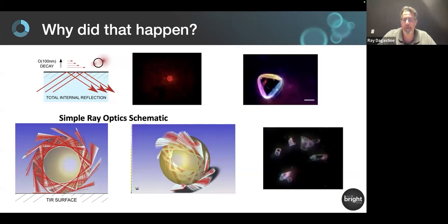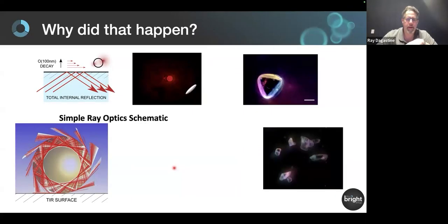And this is just another view where the evanescent wave is down there. The evanescent wave maybe goes 500 nanometers into the surface, maybe a micron, but you're actually able to illuminate structures much larger than that. But why does it scatter things on the inside, like the internal structure in the silicon carbide? Imagine that particle had an occlusion, could be a void, maybe a different region, a crack even.